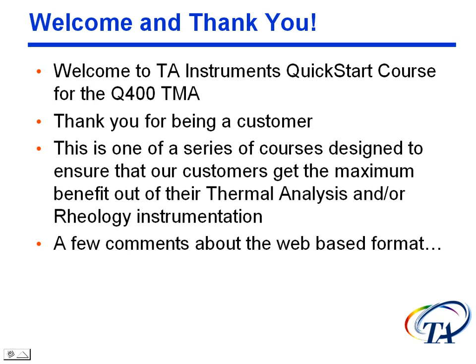Okay? Now, on this web-based format, you will have across somewhere in the screen a little set of buttons that looks like the buttons on your VCR. You can play and fast forward and stop. And you can do that to go through and play this course. You can fast forward it. You can rewind it. You can pause it. And then you can play it again. Okay? So now let's go ahead and get into this course.